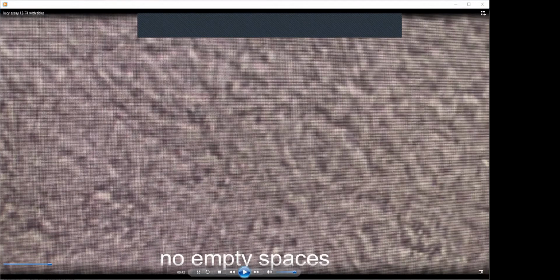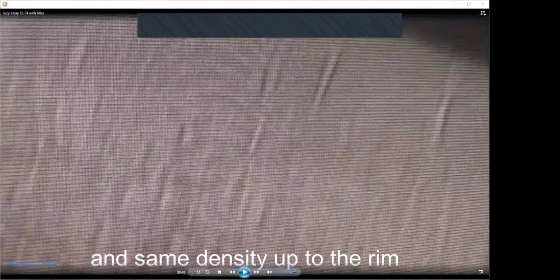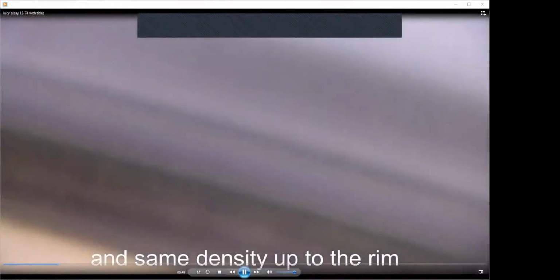So what you see, I have written here also on the bottom of the video in the undertitles, that there are no empty spaces and that the plate is very dense up to the rim, so you don't see any difference between the center of the well and the edge of the well.